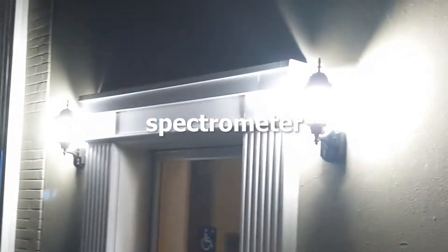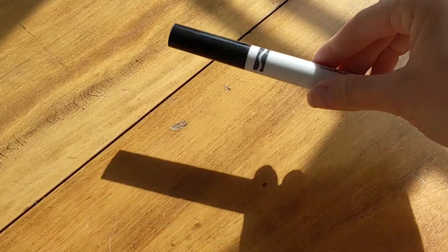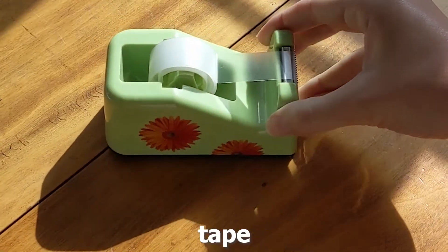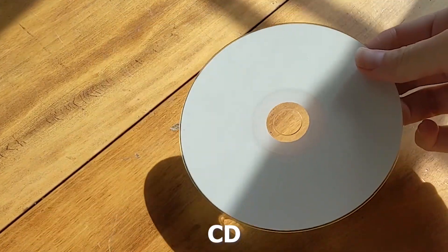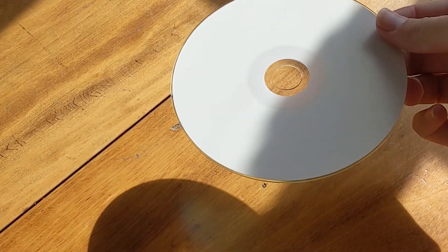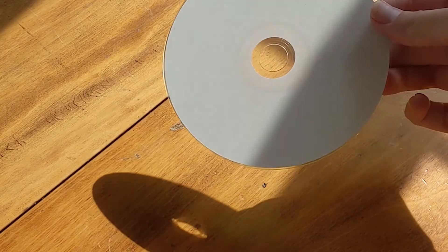To do this, we're going to make our own spectrometer. To make your own spectrometer, you're going to need a marker, scissors or a craft knife, tape or glue, and a CD — used or blank. You may not have a CD yourself, but ask your parents if they have one somewhere. A DVD will also work.